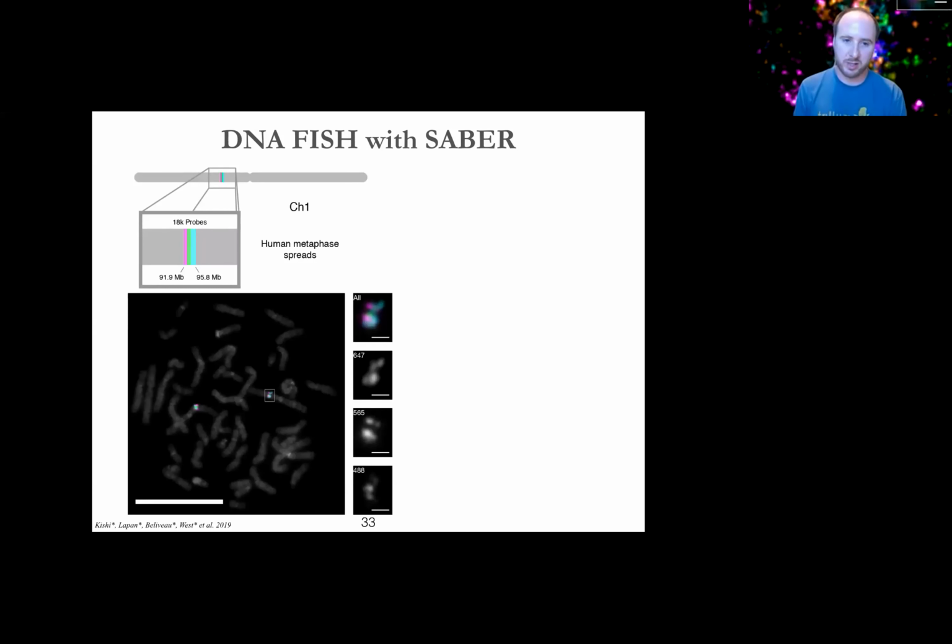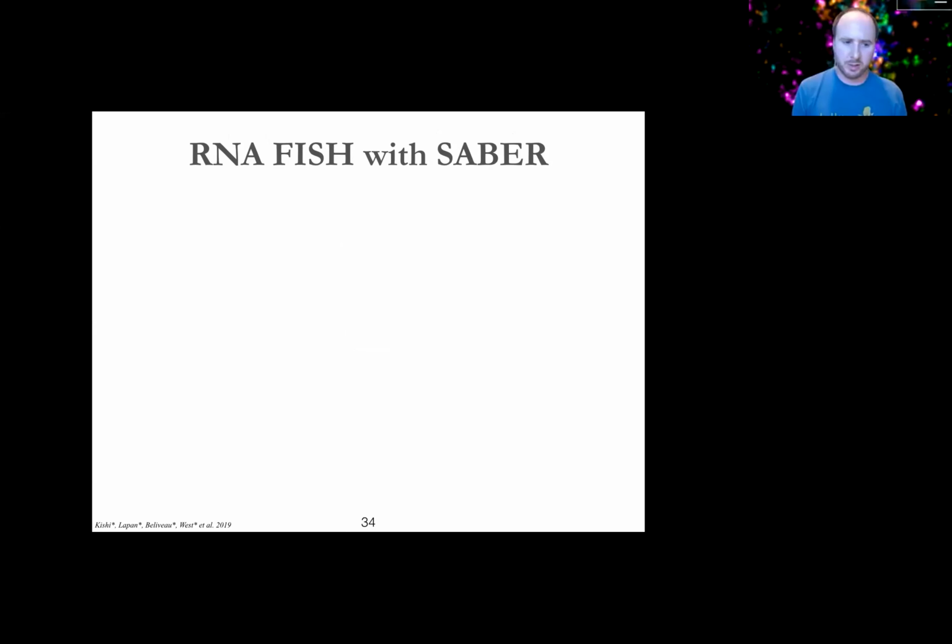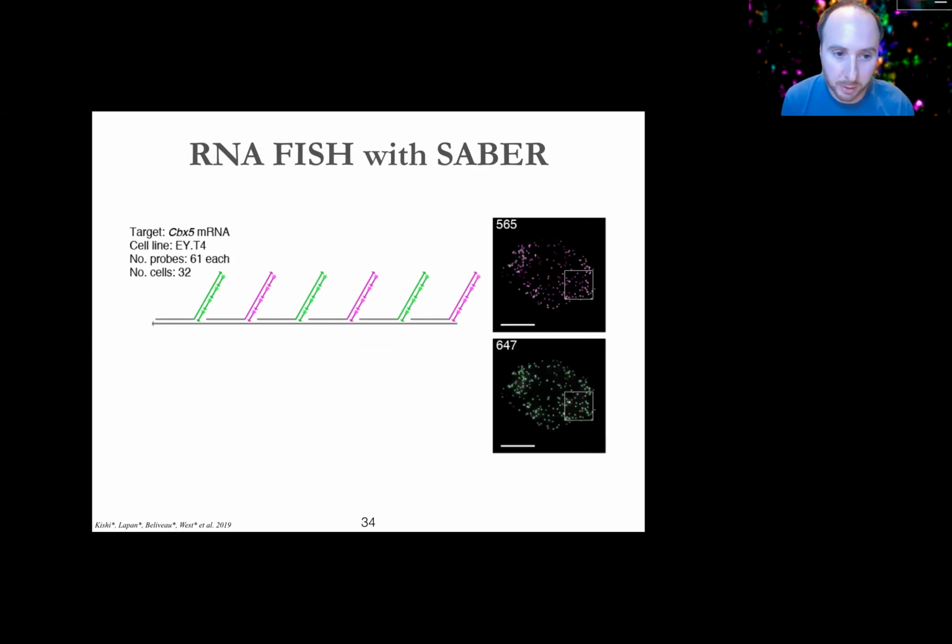For RNA FISH, the validation is a little bit different. So the typical way to do this, and this is taking a play from the Arjun Raj playbook, is to take your transcript and break the probes into 2 flavors. So in this case, 2 different PER sequences being extended and being recognized with different complementary oligos bearing distinct fluorophores. So practically what we're doing is taking, in this case, the CBX5 RNA in mouse embryonic fibroblast cells, and putting 61 green probes and 61 magenta probes on, imaging them separately, and then asking how concordant the two images are after automated image analysis and segmentation.